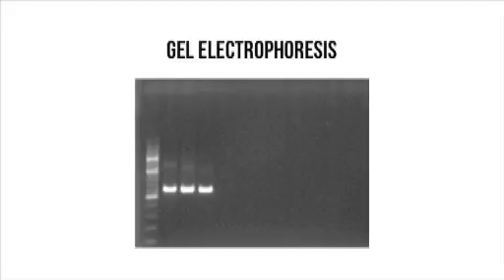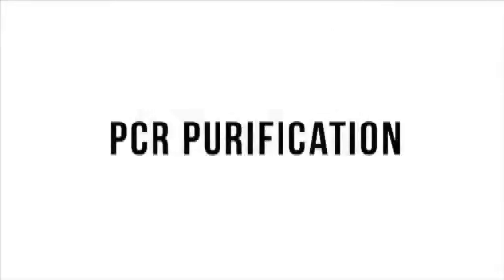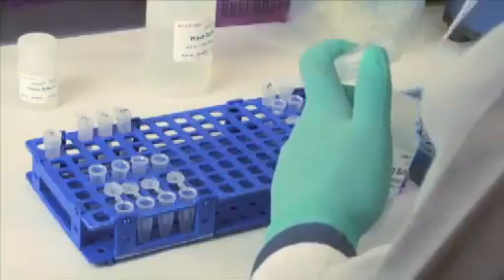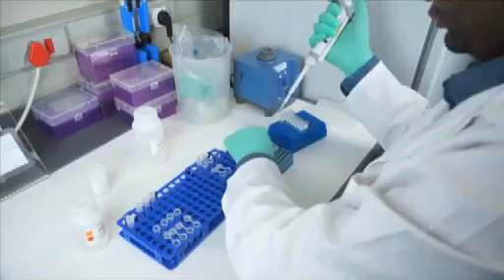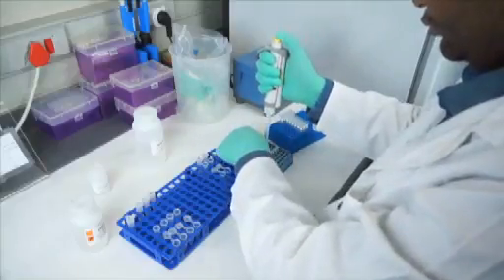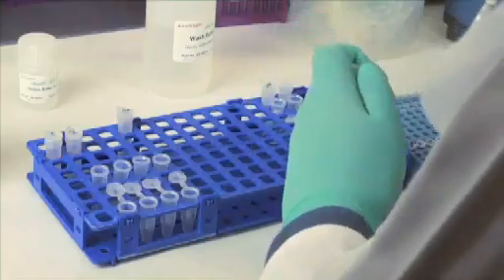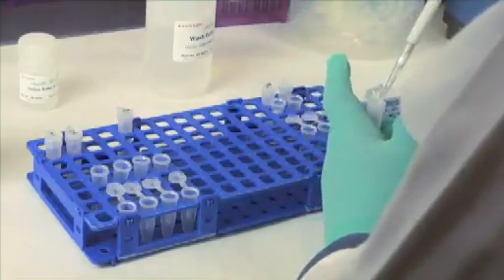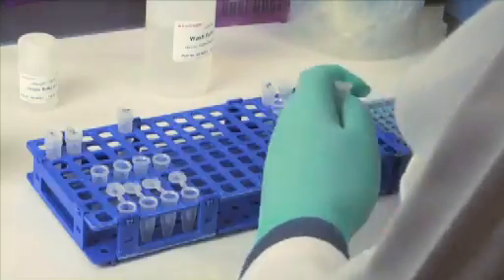There should be no amplification in the negative and reagent controls. In preparation for the sequencing reaction, the positive second round PCR products are cleaned up using the PureLink PCR purification kit. Add 80 microliters of binding buffer to 20 microliters of PCR product and pipette mix. Add the sample mixed with the binding buffer to a PureLink spin column in a collection tube.